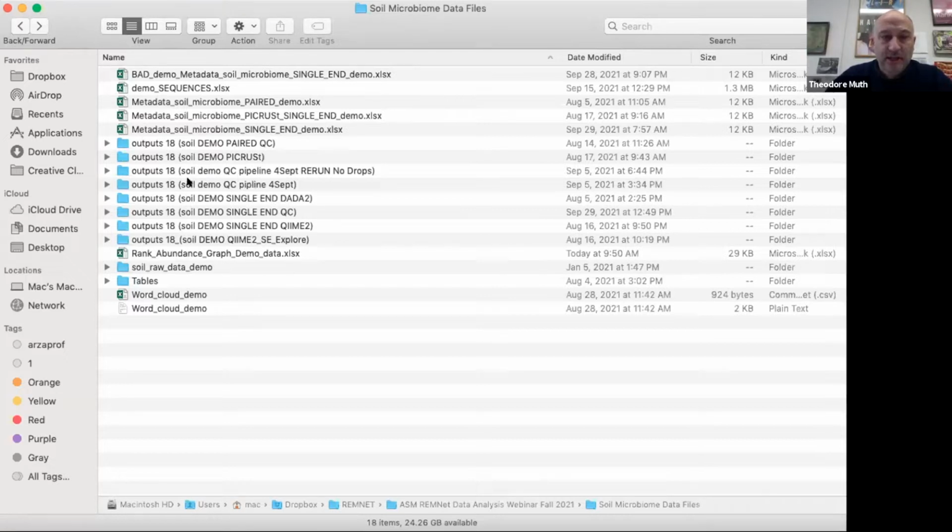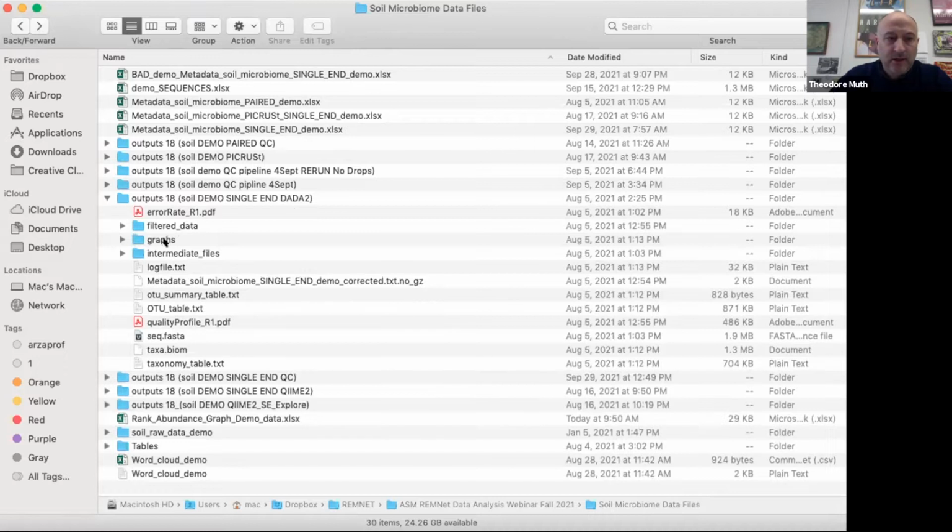So you'll look at output folders like this, and these came out in my downloads folder. I just renamed them. And from that first run, the single end DADA2 run, if you were using the demo files that we provided, you're getting this set of outputs back.